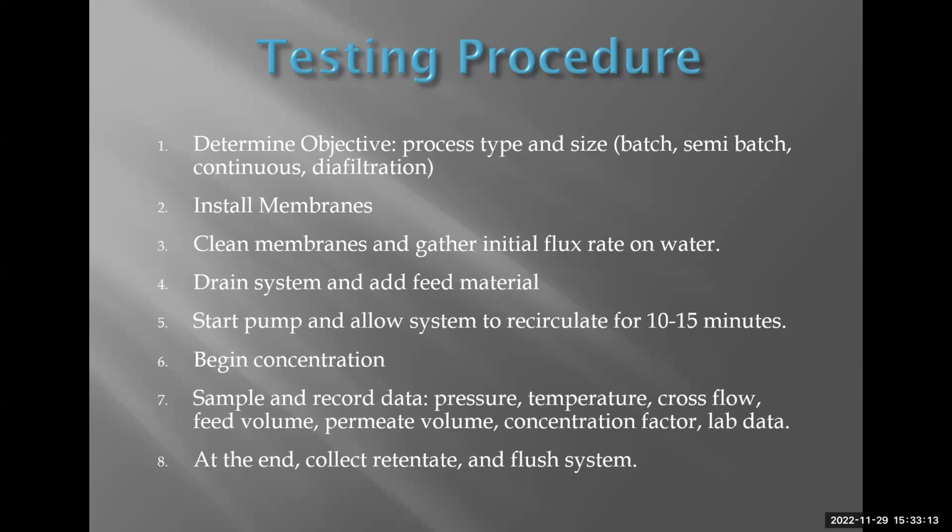And then once you're done running your test, at the end, you would stop the system, you would collect your retentate, weigh both your retentate and your permeate so you can close up your mass balance, and then go ahead and flush out the system.